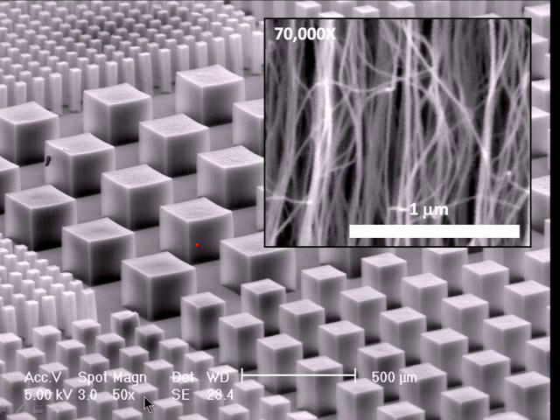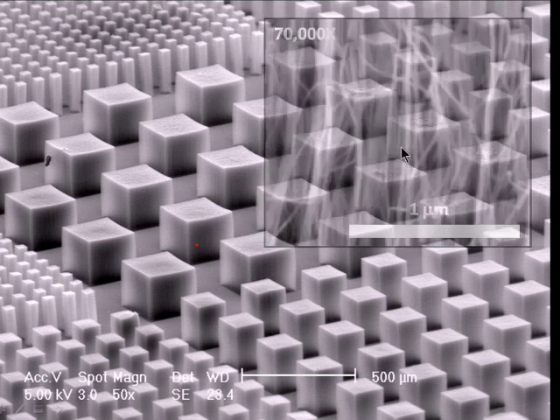I made this little dot, which is still way larger than the dot would be in reality. Maybe the dot is way less than 1 pixel on the screen here, but then you can zoom in and you would start to see the organization of the structures, and we are still far from the atomic level here. If each one of these is a carbon nanotube, which is maybe 10 nanometers in diameter, there's a lot of information which we can capture, and that's sort of the limit of the SEM. You could make this picture maybe 5 times more magnified, but with a scanning microscope we're not going to see the atomic organization. We're going to see that with a TEM, as we'll talk about in just a moment.